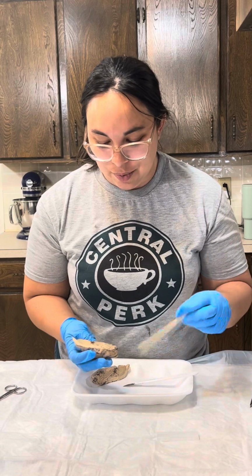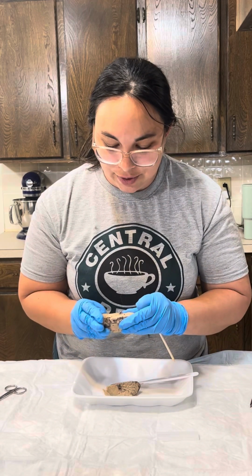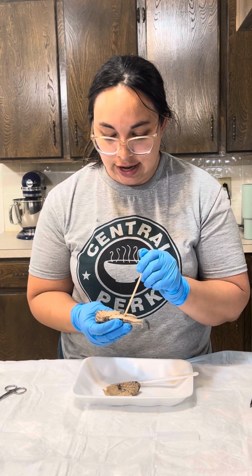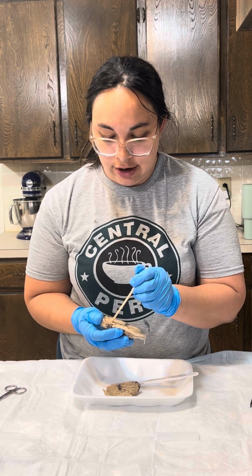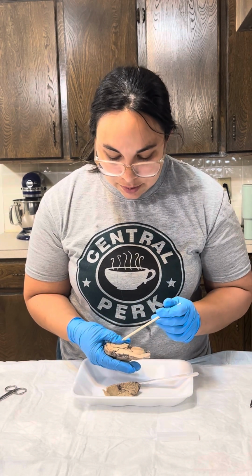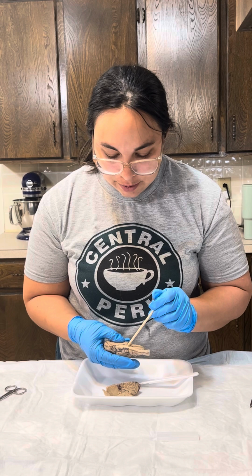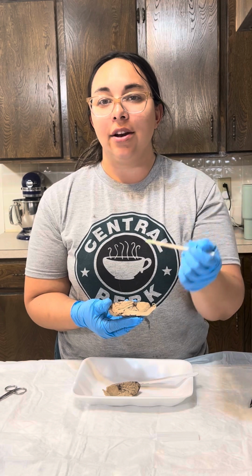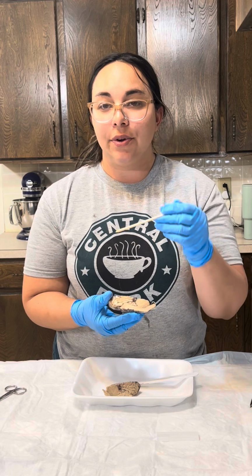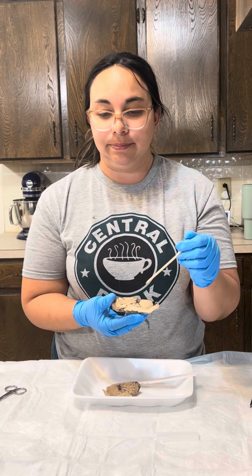A couple of things that I want to note. Let's see, which one of these is better for it? Okay, we're going to say it's this one. There are ventricles inside the brain. There are 4 of them, and they're essentially 4 holes inside the brain. There's one here, one here, and one somewhere else. And what the ventricles do is they have cerebral spinal fluid that goes through them. Their job is to make sure that the spinal fluid gets to all the parts of the brain.